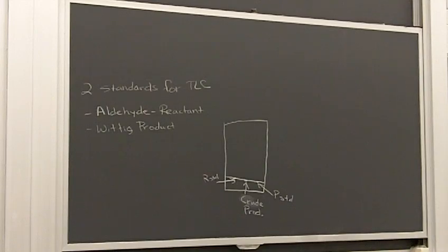So in the end, you'll have a round bottom flask that has a residue in it that doesn't look like very much, but it'll be enough to work with. And then you will have made and developed a TLC plate. I would hang on to that TLC plate because you're going to use it as a reference for your column next week. So once you develop it and draw it in your notebook and make all the measurements for Rf values, I would put it in a paper towel and save it in your drawer till next week, so you've got it for reference for running the column.